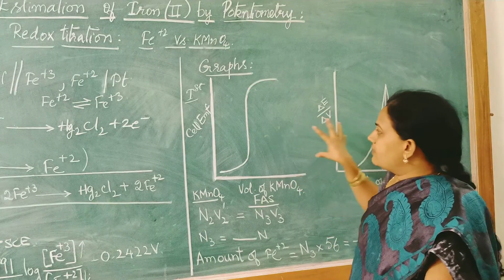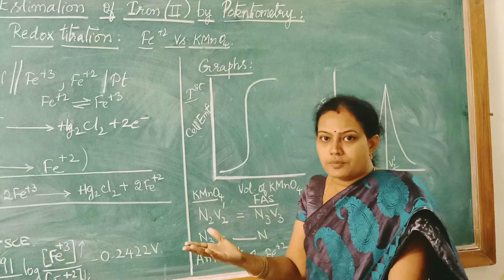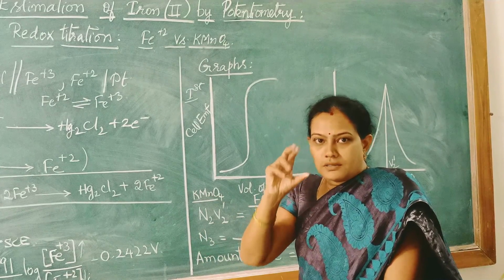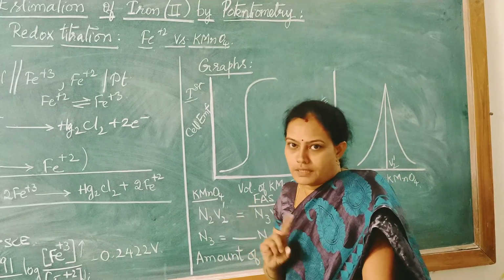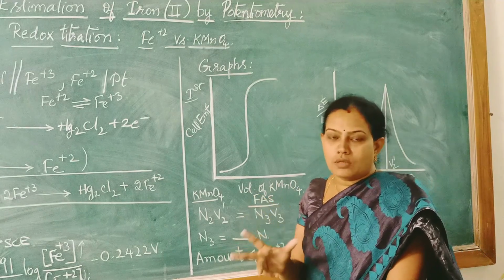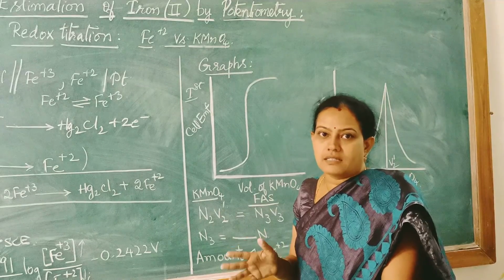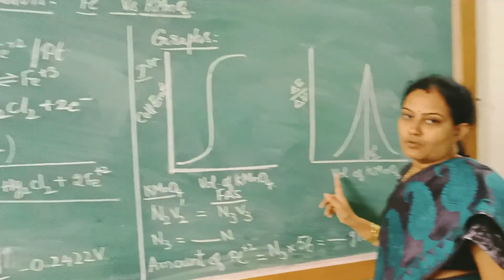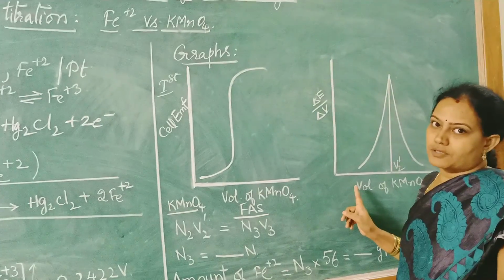Similarly, say this is between 9 and 10 ml. Like I have shown you in the previous experiment, there is going to be a continuous 0.2 ml addition near the end point of the reaction, to have a close watch on where exactly the complete reaction has taken place, and to record the exact volume of KMnO4 required to oxidize the 20 ml of ferrous solution taken.